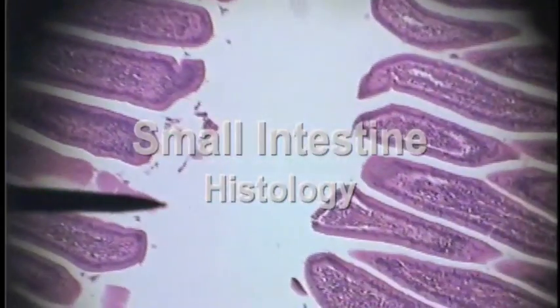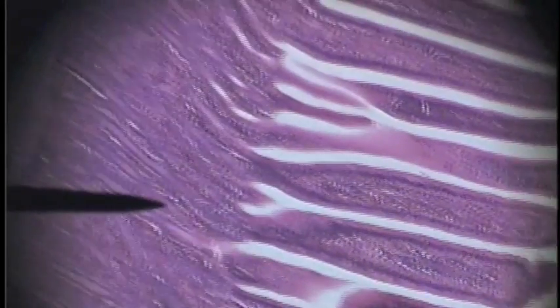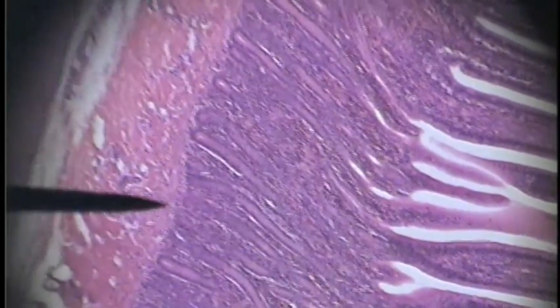Now we're in the small intestine. Here we see the villi of the small intestine. This dark purple staining tissue here is part of the tunica mucosa. All of this dark purple tissue is tunica mucosa.